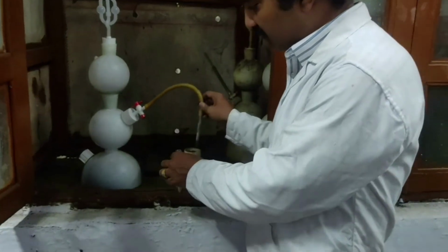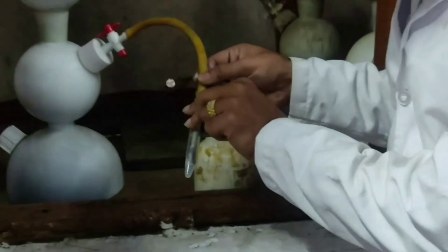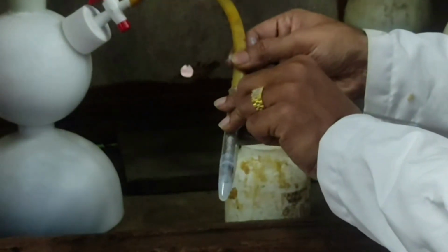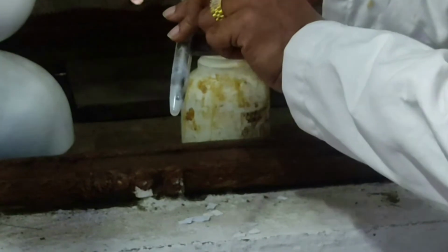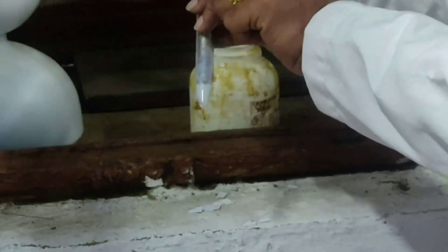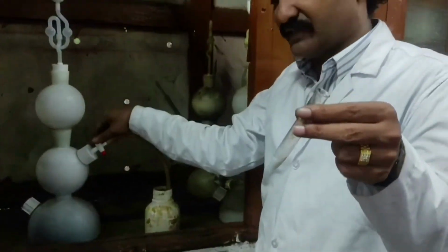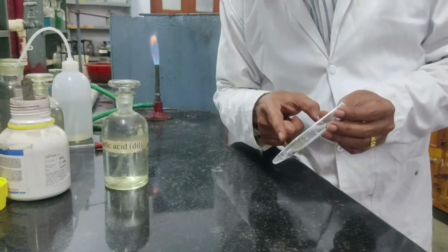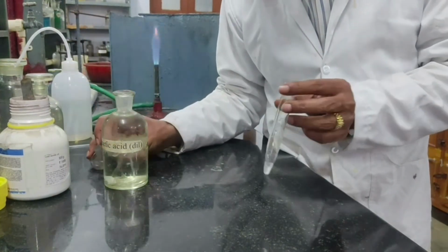Now I am passing H2S gas, you see. Slowly I am passing. H2S gas is passed and you can see a beautiful white precipitate formed. You see that? A white precipitate is formed, indicating the presence of zinc+2. This is zinc sulfide.